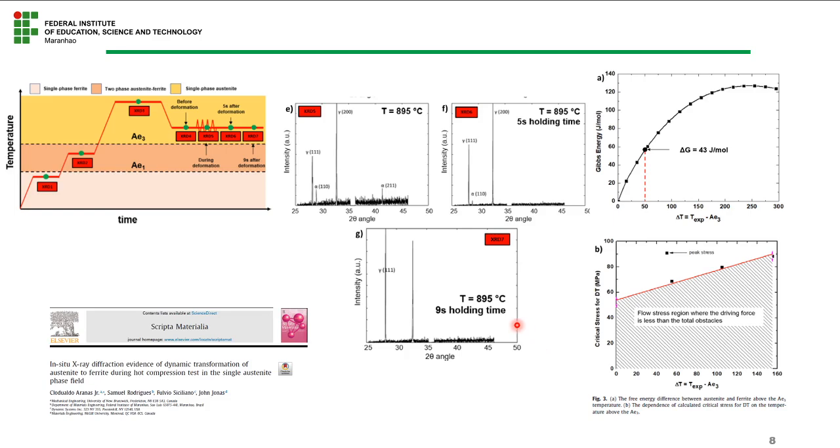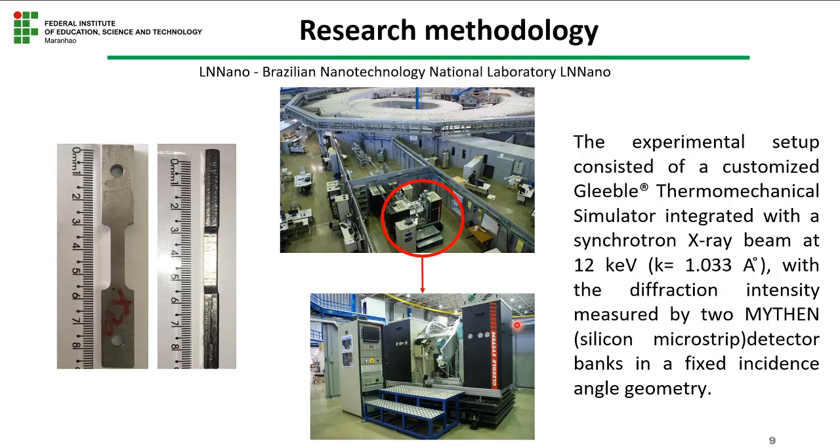And continuing with this presentation, what we did now was another test, not compression anymore, but a tensile test. And this is the laboratory that we used, the LNNano Brazilian Nanotechnology National Laboratory.